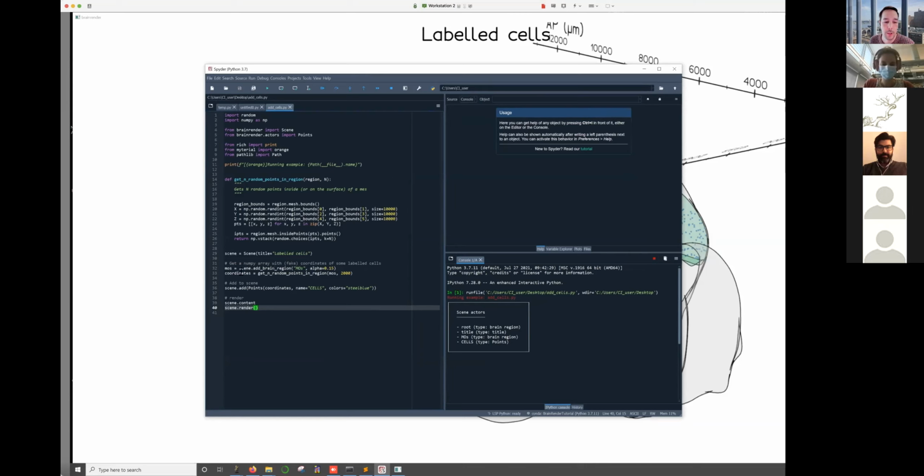While we're waiting here, you can actually see how to interact with BrainRender. In this case, we could even take this out. If you were just trying to plot a brain region, then all you would have to do is say scene add, and there's a few different add functions, but this one says add brain region. Then all you would have to know is the acronym or abbreviation for that brain region. And this alpha setting here is just a transparency setting.